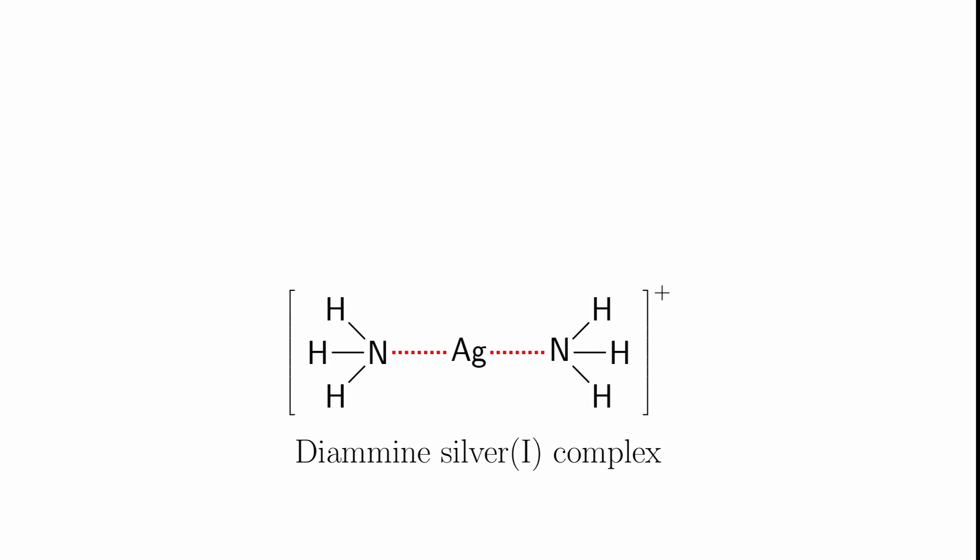The way we do that is we have a solution of silver nitrate to which we add sodium hydroxide. This produces a black precipitate of silver oxide. Then we add ammonia solution to this until the precipitate dissolves. That's when we know we have the silver complex.